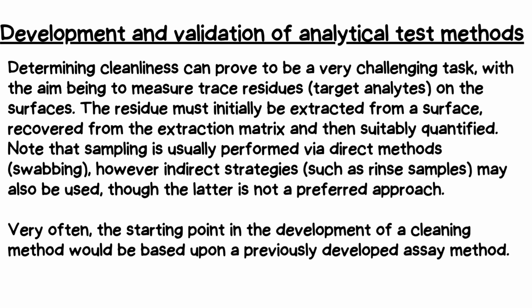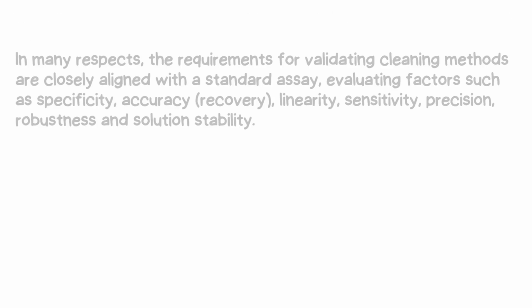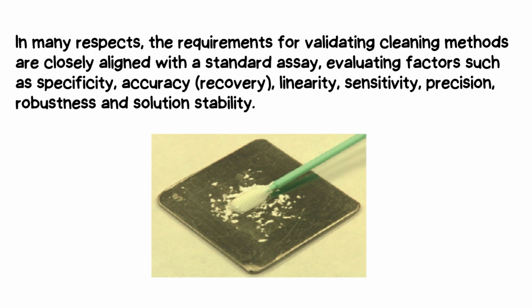Very often, the starting point in the development of a cleaning method would be based upon a previously developed assay method. In many respects, the requirements for validating cleaning methods are closely aligned with a standard assay, evaluating factors such as specificity, accuracy, recovery, linearity, sensitivity, precision, robustness, and solution stability.